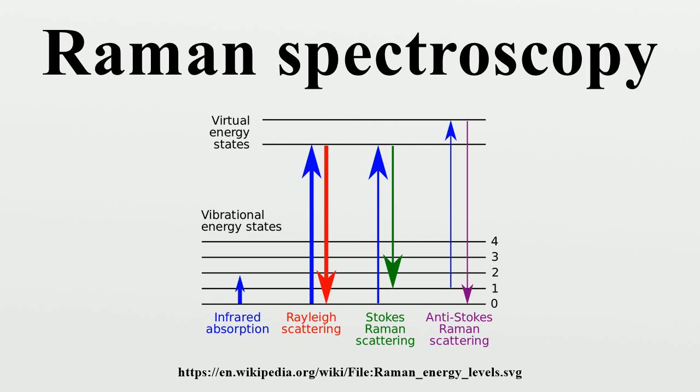Spectra acquired with the analyzer set at both perpendicular and parallel to the excitation plane can be used to calculate the depolarization ratio. Study of the technique is useful in teaching the connections between group theory, symmetry, Raman activity, and peaks in the corresponding Raman spectra. Polarized light only gives access to some of the Raman active modes. By rotating the polarization you can gain access to the other modes. Each mode is separated according to its symmetry.